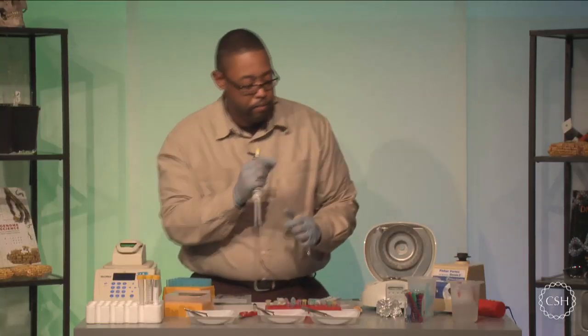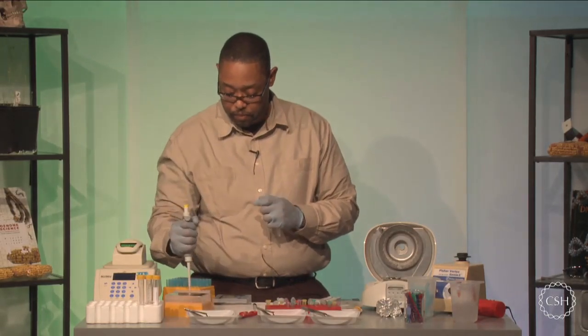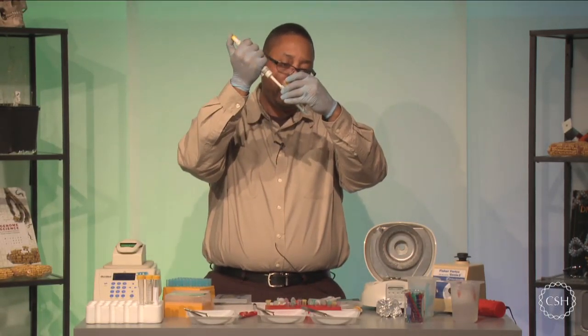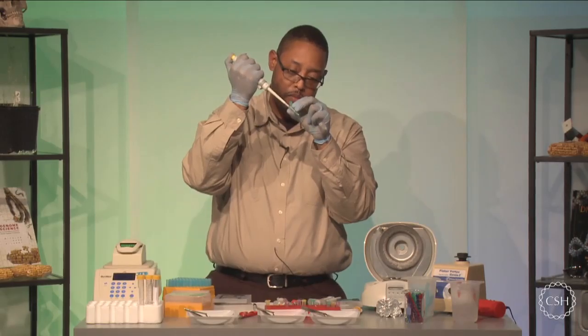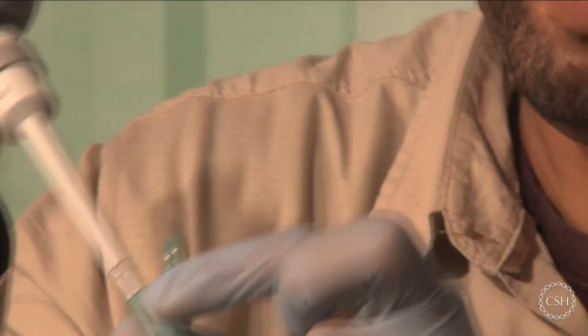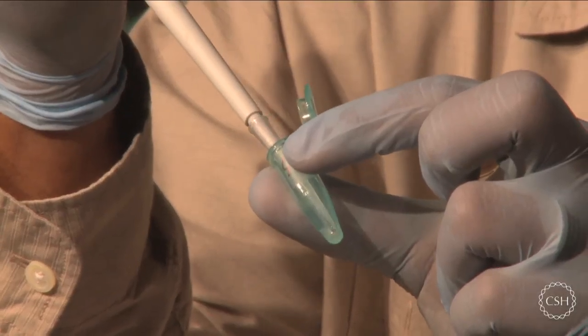I'm going to place that down and eject off my tip and move to the next test tube. I'm going to draw another 100 microliters of my distilled water, and I'm going to add that to the next test tube. And I'm basically going to break up the pellet. You can see here that I've broken up my pellet. Solution got really cloudy.